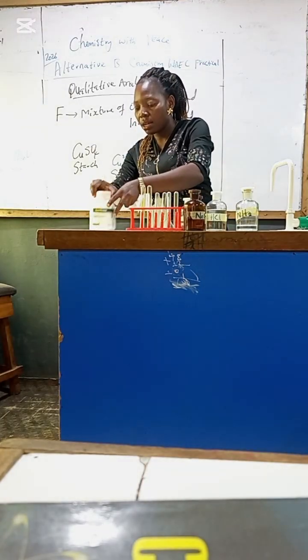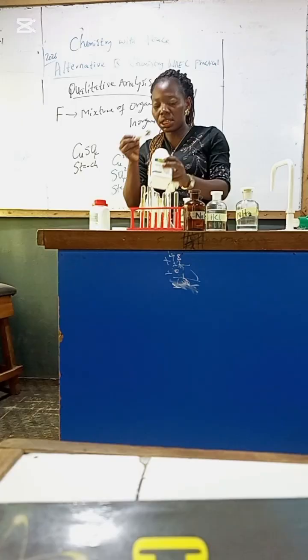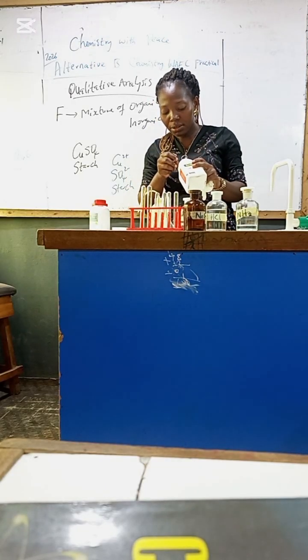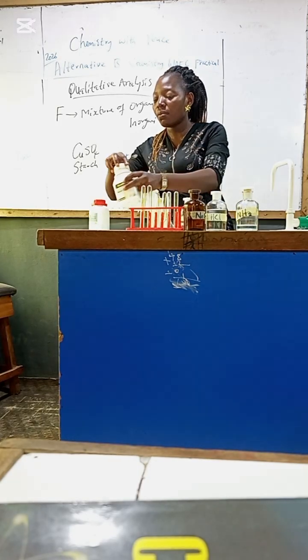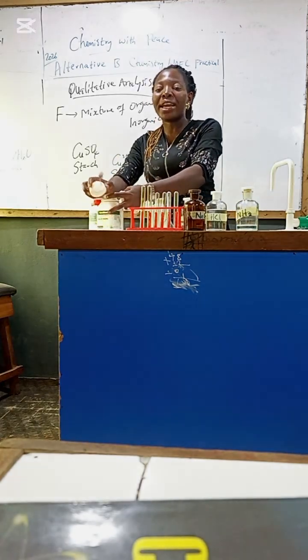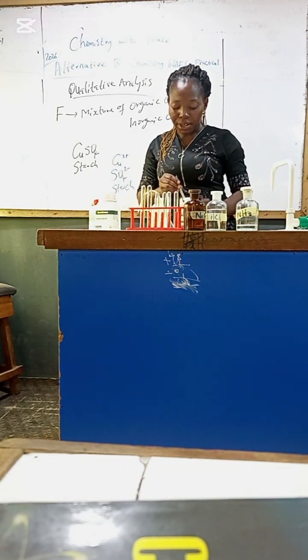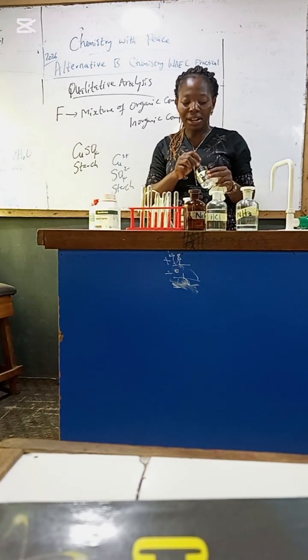Then our second test tube. This is our starch. Make sure you weigh it using the weight balance. Okay, so I will mix the mixture very well.